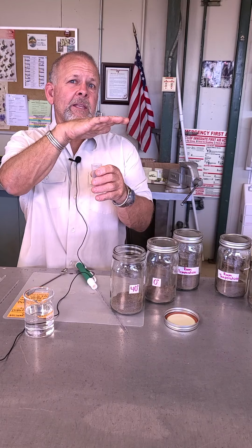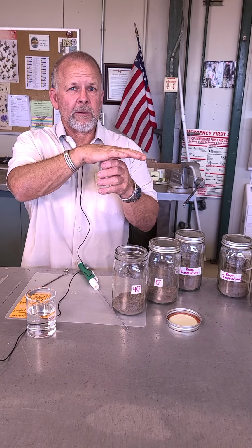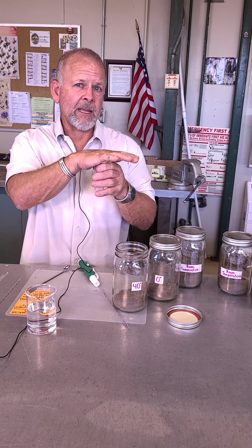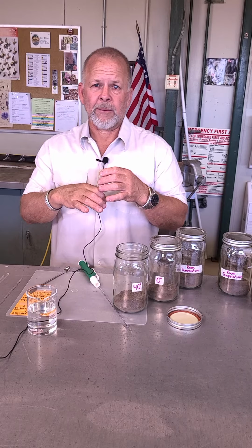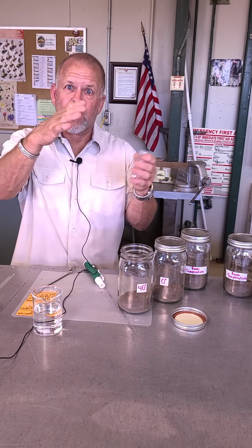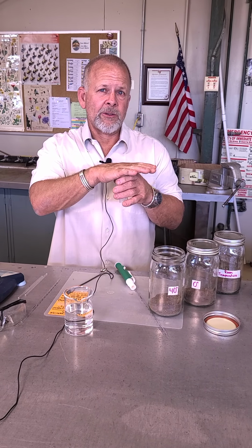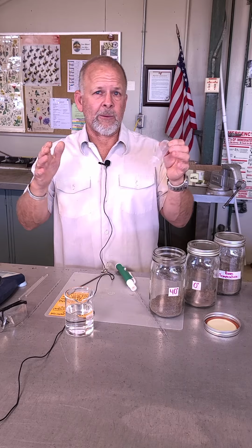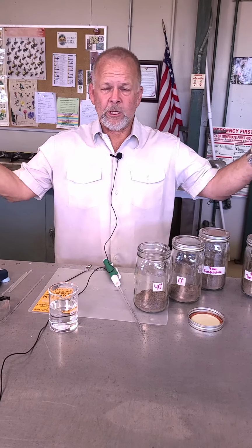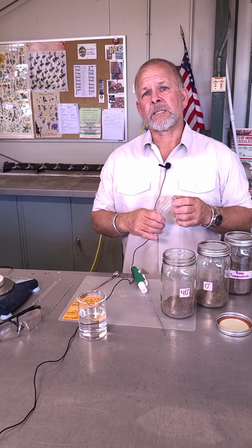We can then extract that, which we'll do in an upcoming week, and measure the concentration of carbon dioxide in it. It's a simple chemical reaction: measuring how much it takes to cause the reaction, and then we'll be able to convert that into carbon dioxide amounts. You'll be able to see that we can translate that not only into this little microcosm, but we could do it at field level or whatever we wanted to. So it has some real practical, real world significance as well.